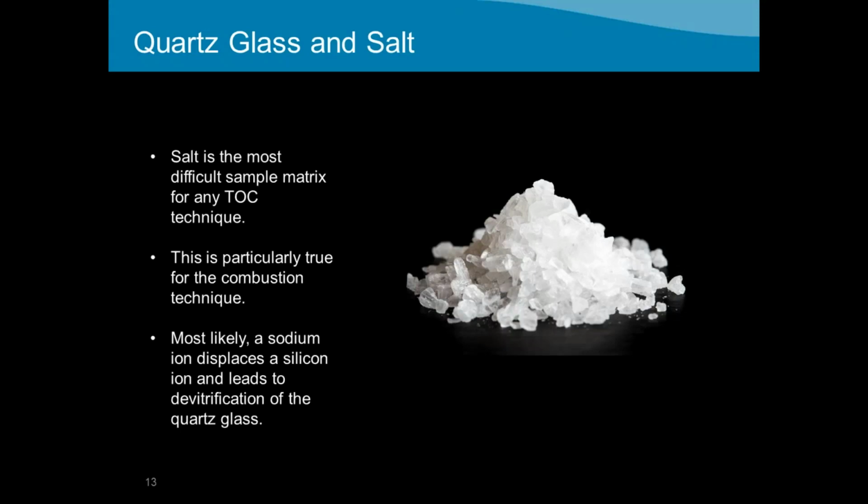Salt-containing samples are probably the most difficult samples for any TOC technique. This is particularly true for the combustion TOC technique. Aside from the deposition of salt on the catalyst and other packing material, salt leads to what is known as devitrification of the tube itself.